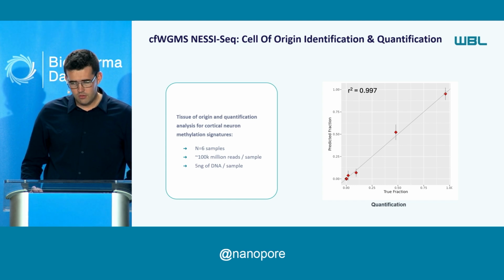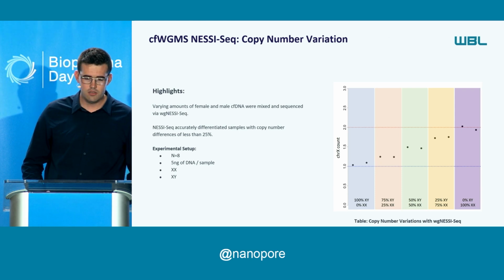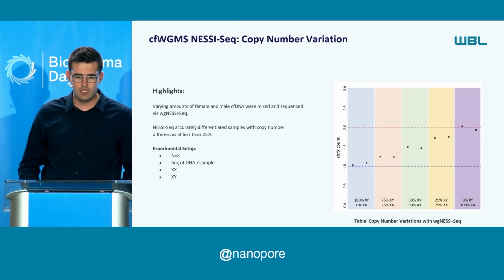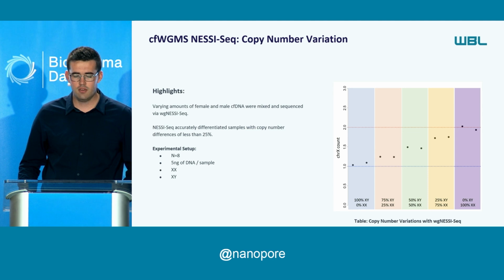When you get into the genetic side, we still see a very strong ability to utilize this information for your traditional copy number variation, structural variation, and single nucleotide variants. This example is a situation where each sample had roughly 0.3 to 0.4x coming off of our platform for methylation.